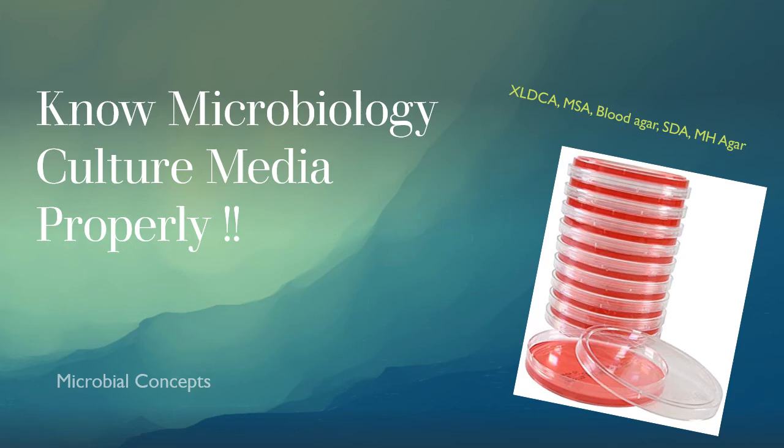This is part 2 related to culture media, knowing microbiology culture media properly. In this video we will be covering XLDCA, MSA that is mannitol salt agar, then blood agar, Sabouraud dextrose agar and MHA that is Mueller-Hinton agar. So this is part 2. If you had missed watching the first part, which contains information related to nutrient agar, then MacConkey's agar, citrimide, EMB agar, then please watch that part also. So let's start the second part.